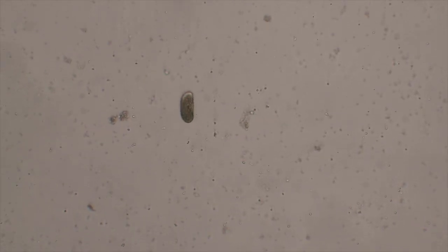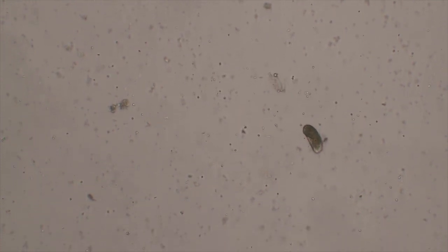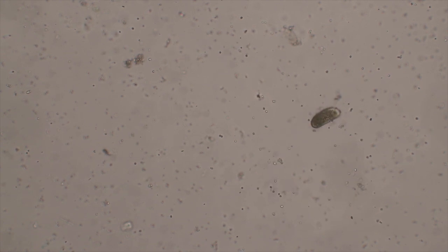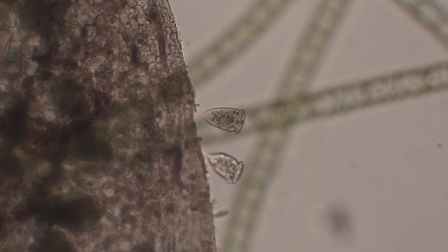This is a ciliated protist — a large single-celled organism whose cilia are like hairs covering the organism. They beat together in coordinated waves, allowing this thing to whizz and spiral around at very high speed as it chases after prey.